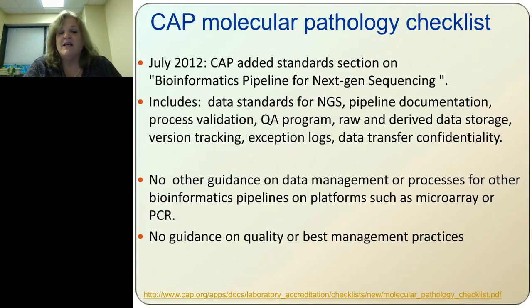But essentially, especially the version tracking, it's all very nice to see because it's all stuff that wasn't previously required for a lot of laboratory data. However, there's no other guidance really on data management of processes for other bioinformatics heavy platforms, such as microarrays or high complexity PCR experiments, like array PCR experiments.